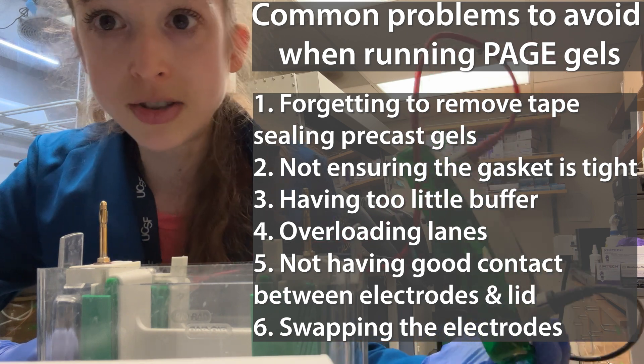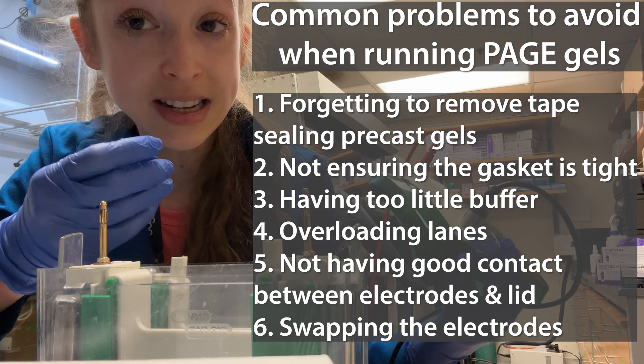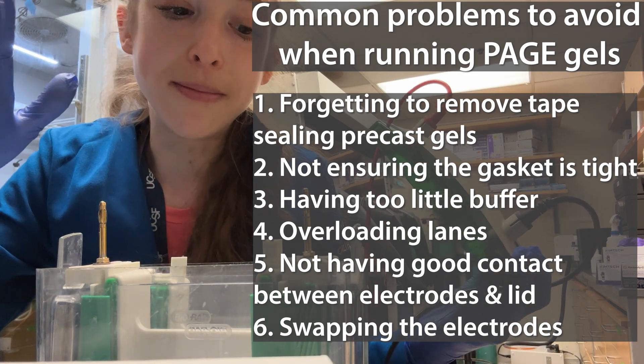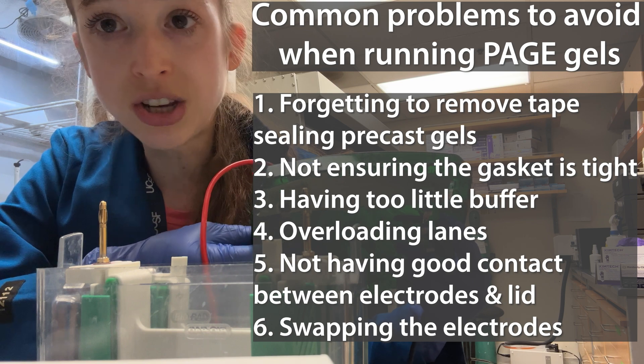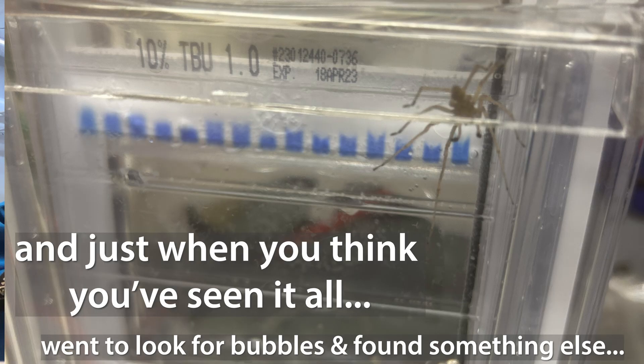So I hope that helps you avoid some of the most common problems. Remember to remove that tape, tighten your gasket snugly, make sure there's enough buffer, make sure your electrodes are touching your power box, watch for those bubbles, and don't load too much. Happy gel running!